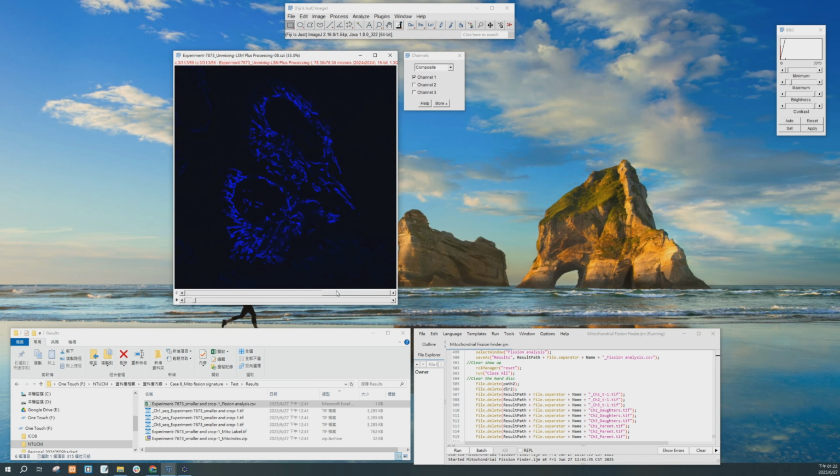Besides being composed of 3 channels, it is actually an image with a long time axis. At the same time, you'll notice that, as the image is captured, its brightness gradually decreases. So, during our post-acquisition image analysis, some corrections need to be made.